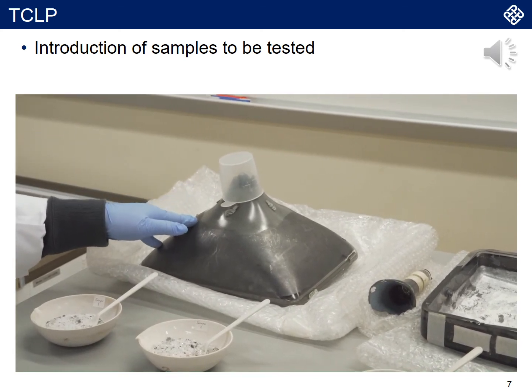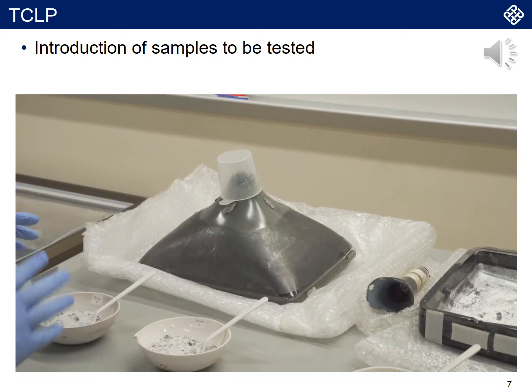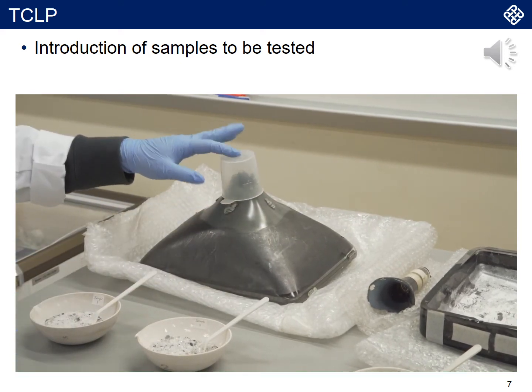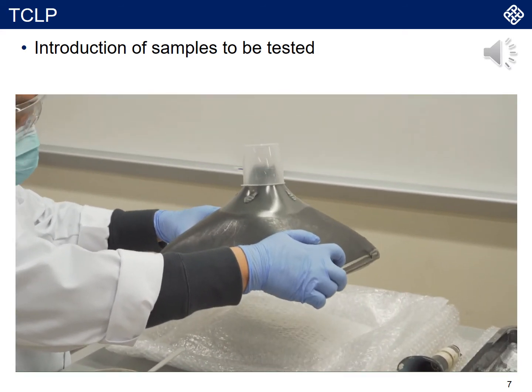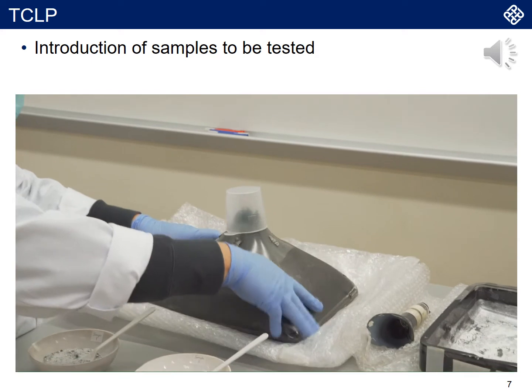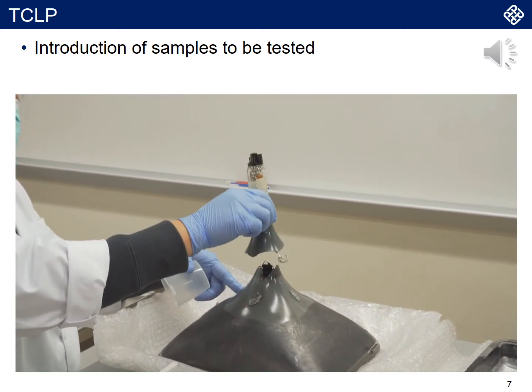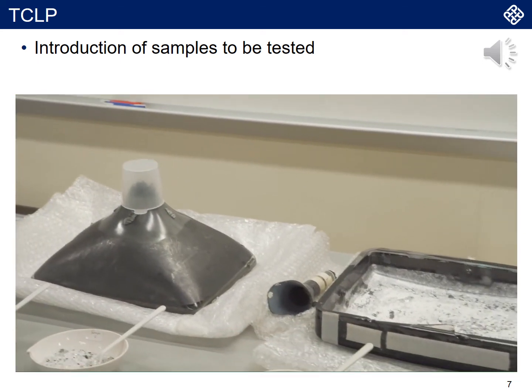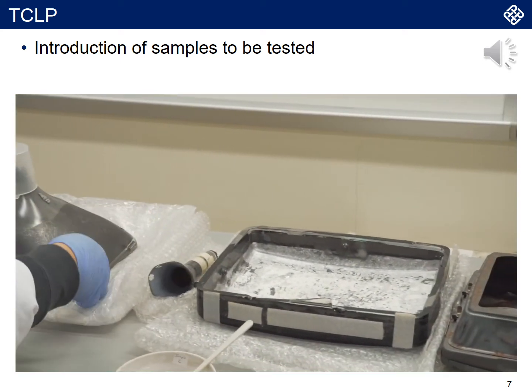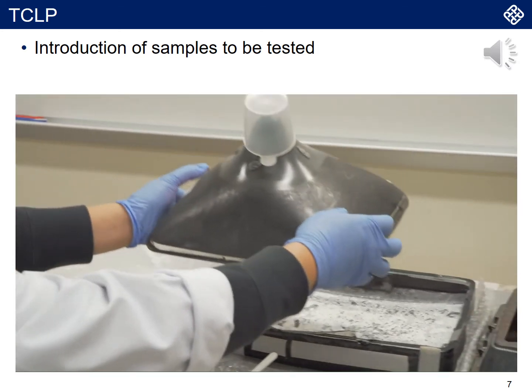You can see it's a very big compartment, and there are several sections. This is the screen, and I don't know whether you have seen this kind of screen at home or anywhere. And this is the tube at the end of that screen. Before we do the experiments, we need to separate out the three compartments.